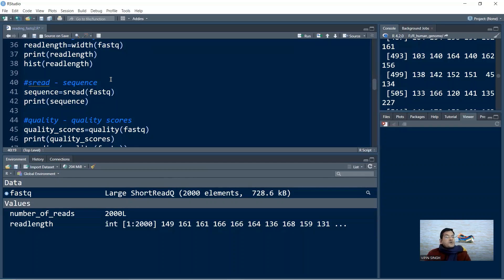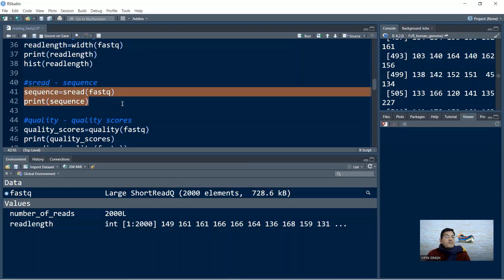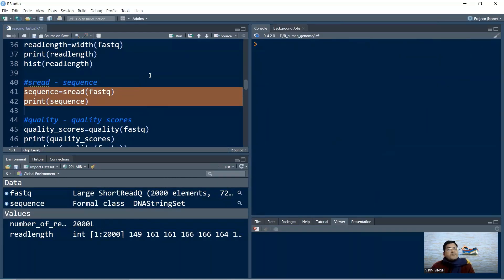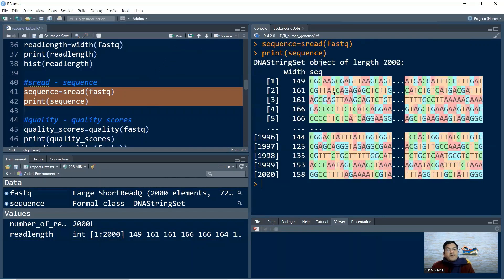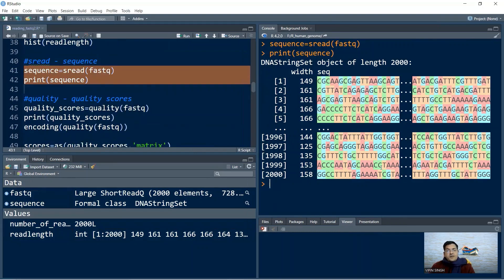The sread() function pulls out the sequence line from the FASTQ file. We say sequence <- sread(fastq), then print sequence. This gives a preview showing the five-prime and three-prime ends of each sequence, with three dots indicating the middle portion. It displays the first five and last five sequences, along with the width — for example, the first sequence is 149 bases and the fifth is 166 bases.